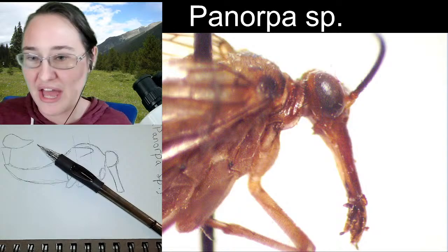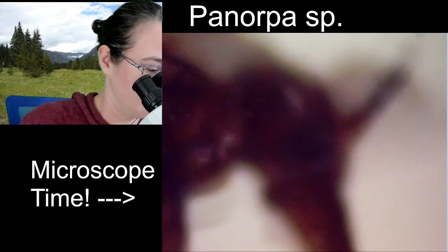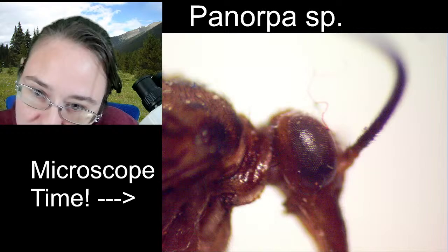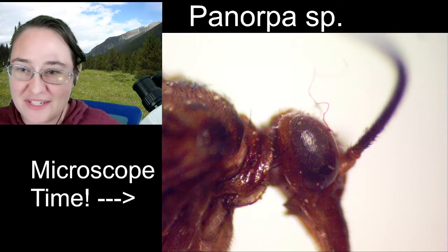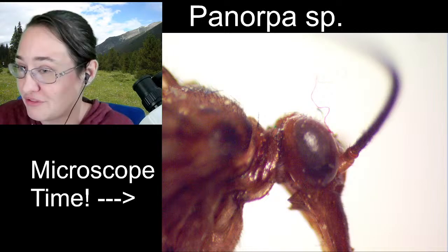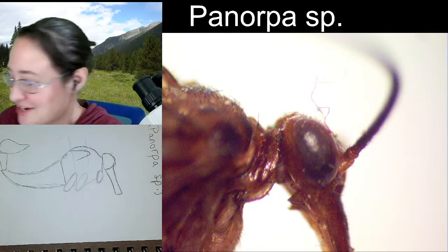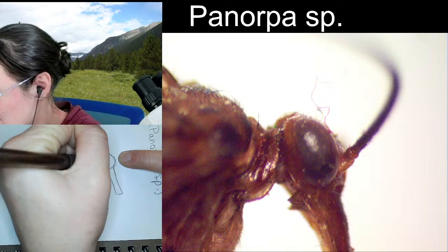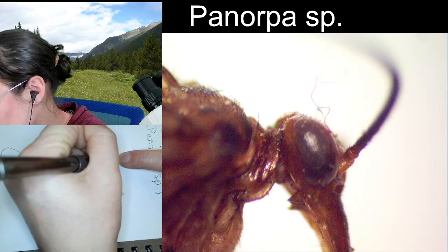I'm going to get closer to the head — zoom in to the top portion of the head, because I want to see a little bit more around the eyes before we get started. So this is going to be the top half of our head here. They have fairly large compound eyes — I'm honestly not sure how well they see. I do know that they primarily eat dead insects, which is kind of cool. The compound eye takes up most of the head, and it's narrower on the top than at the bottom — it gets wider towards the bottom.